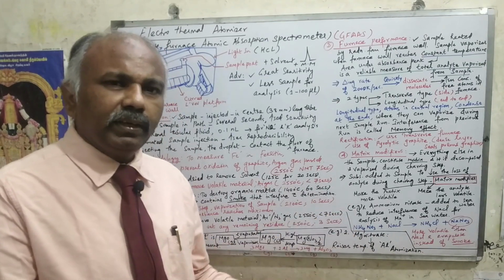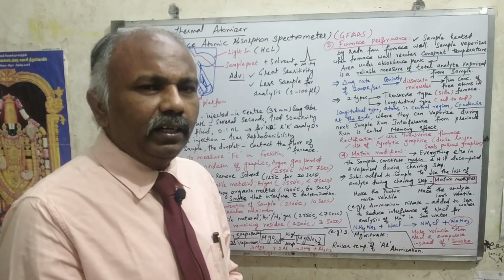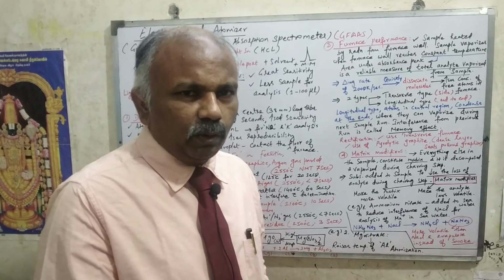So this is all about the various purposes of using a matrix modifier in atomic absorption spectrometry. I hope you understand in a better manner.